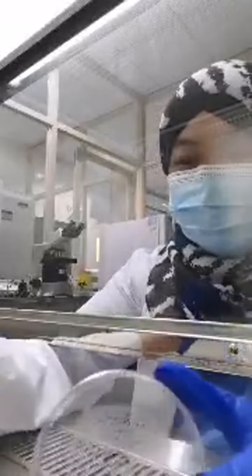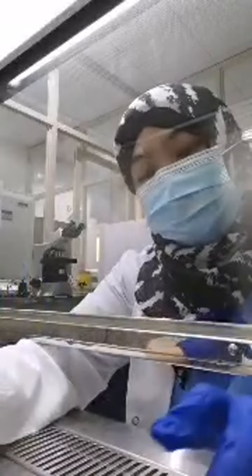This one is stuck, so it will form a bubble. See those beautiful bubbles? If I put the H2O2. This is not how you handle the culture, but for you to see it, I need to do it like this. It's beautiful. It's amazing.